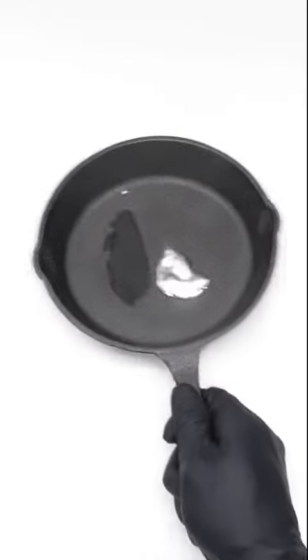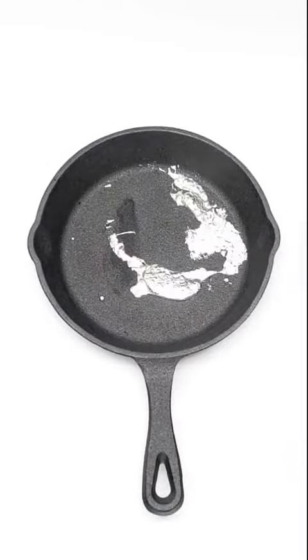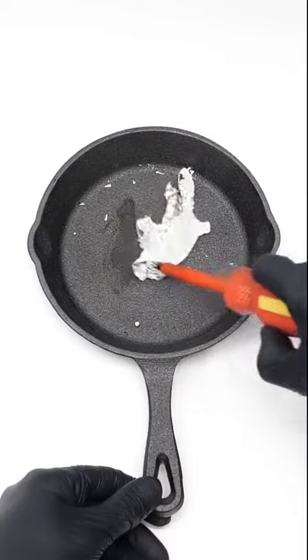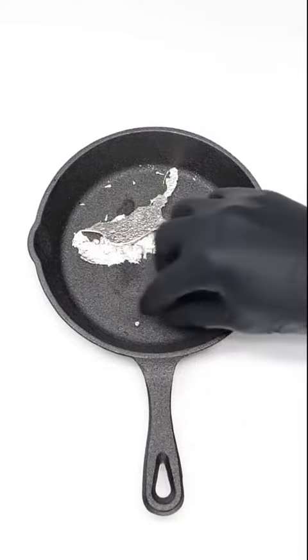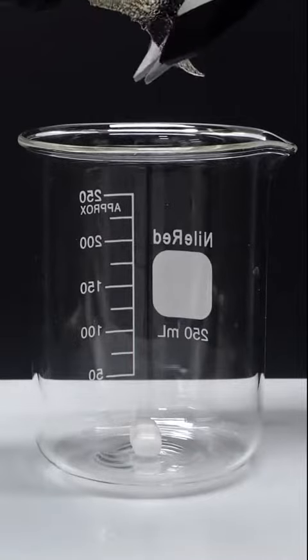What I have to do now is spread it out as much as I can. I honestly kind of failed doing this, but I think it still turned out okay. The tin that I have now is way cleaner, and I'll cut it into some smaller pieces.